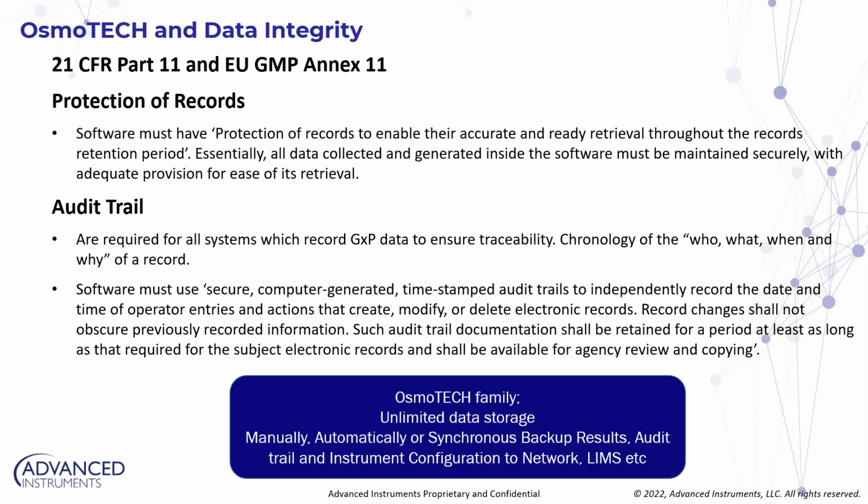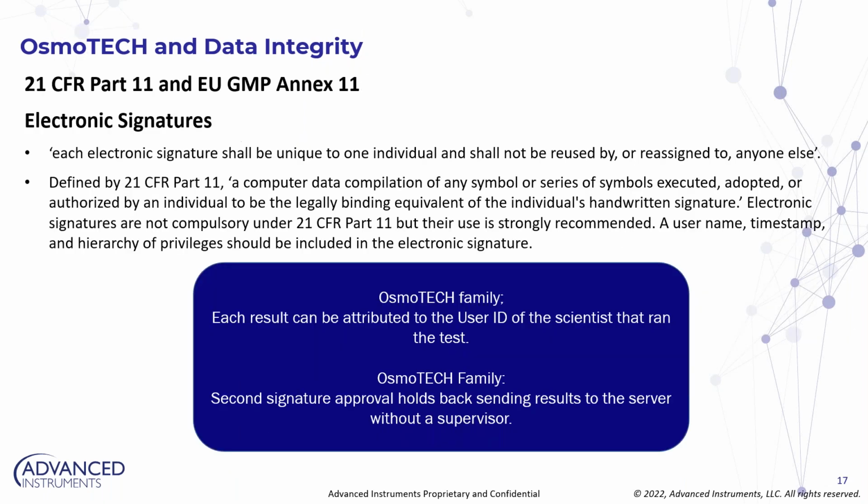So if a user ran a sample and tagged it incorrectly, it would still be there, memorialized in the audit trail. The only thing that user can do is provide more color, right? They can go in and log a comment saying, error in sample ID for sample run, correct sample ID is XYZ. So there's really no way for any action to be done on the device and for it not to be recorded, so that you can look at it any other time for review.